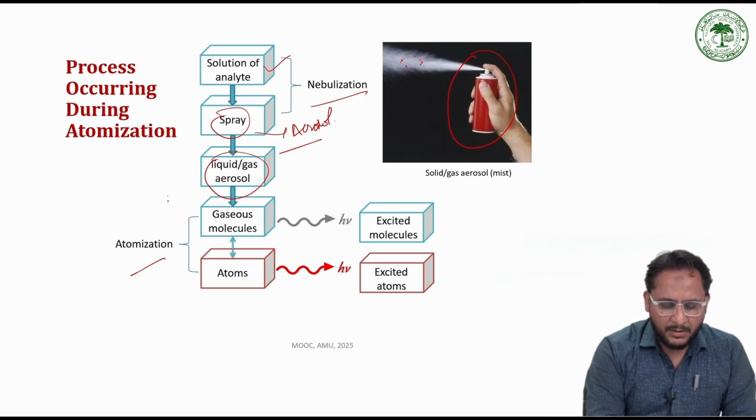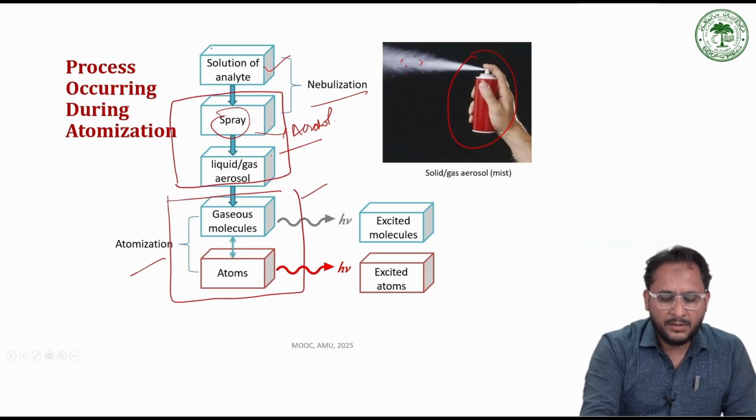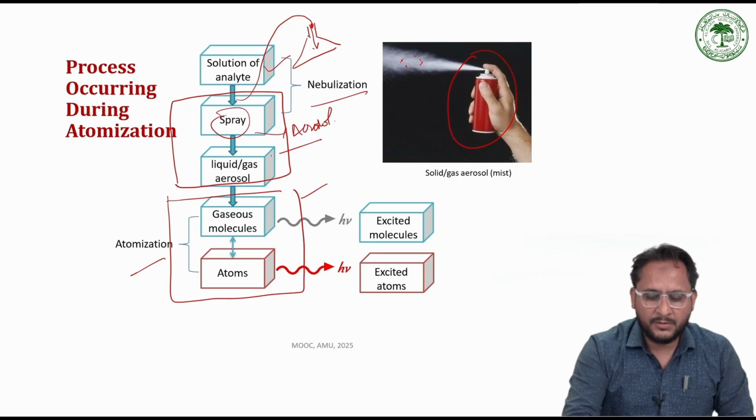into the atomizer. So this is our atomizer unit. Effectively, this is the nebulizer unit. This is the solution of the analyte which we placed in a conical flask or in a beaker, and we take the inlet pipe of the nebulizer and dip it in this solution. Through this pipe, the sample is injected into the nebulizer to form the aerosol, and this is our atomization unit.